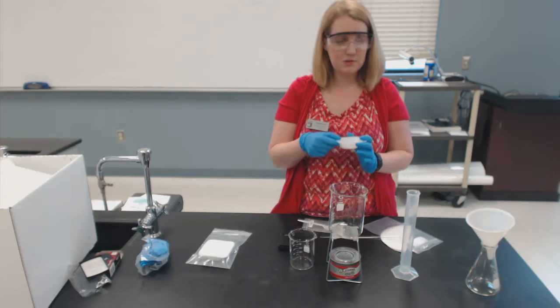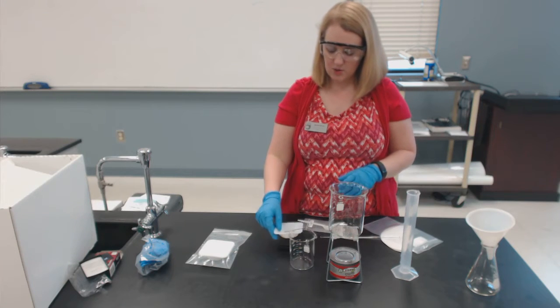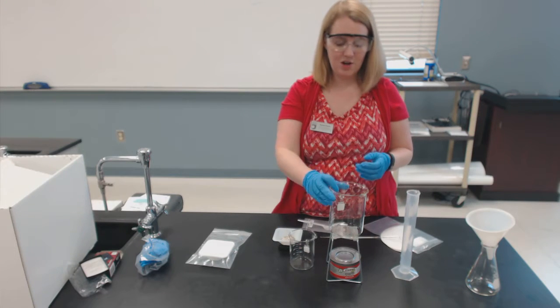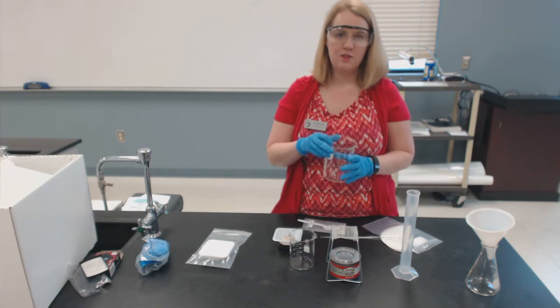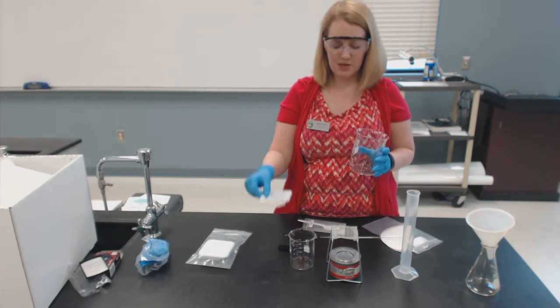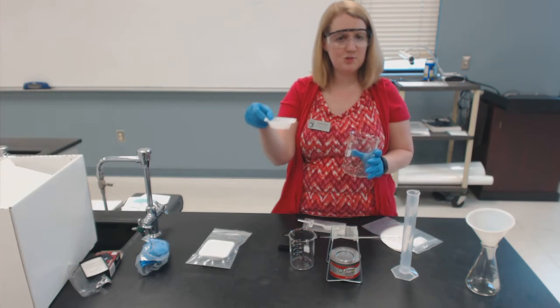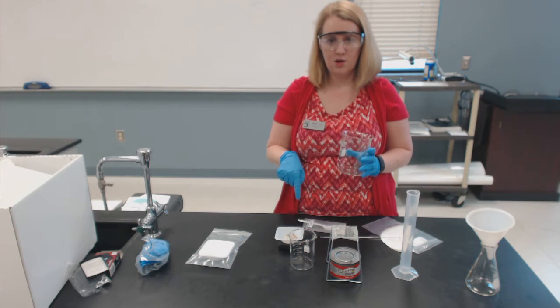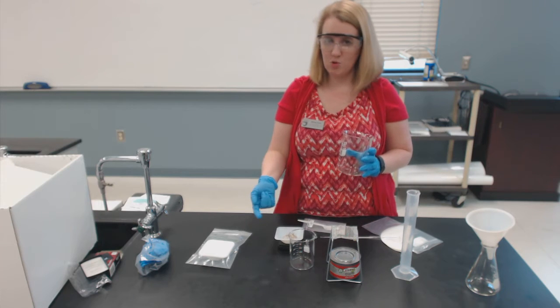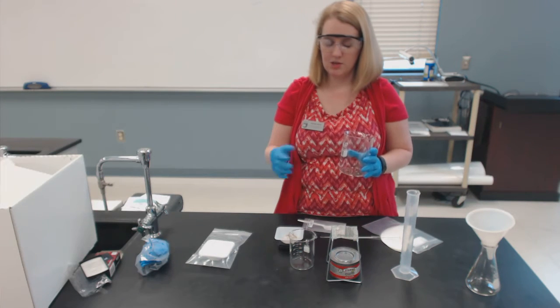Also, these weigh boats are plastic, so if you touch something to them that is very hot, such as the side of a hot beaker, it will melt the weigh boats, so be careful of that. By the way, these weigh boats do have mass, so you do still have to tare your scale when you have the weigh boat on it before you add anything to it. Otherwise, it will look like there's no mass there.